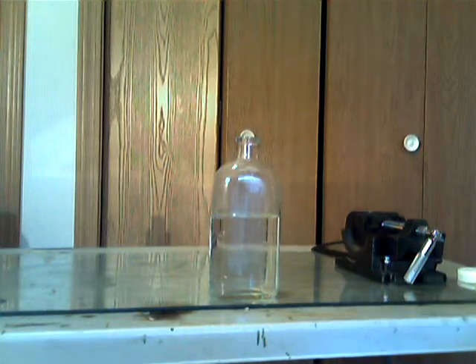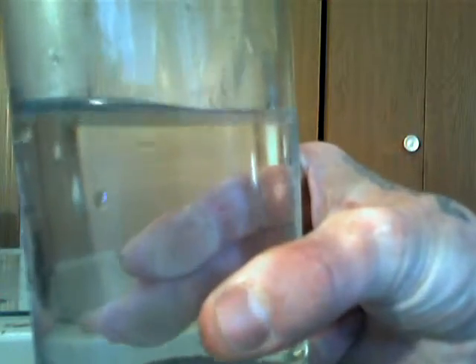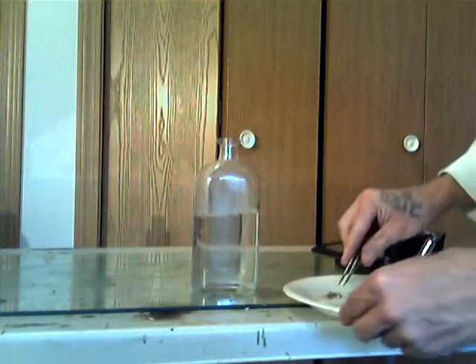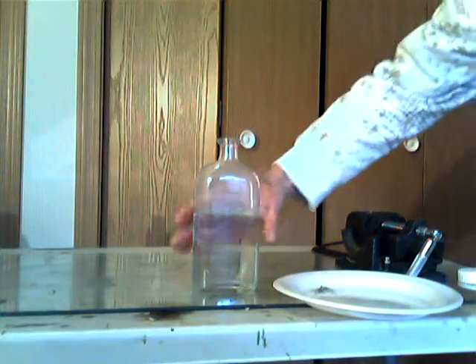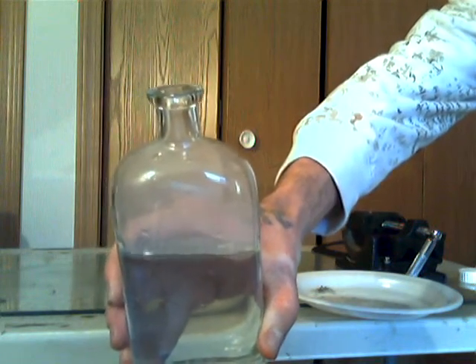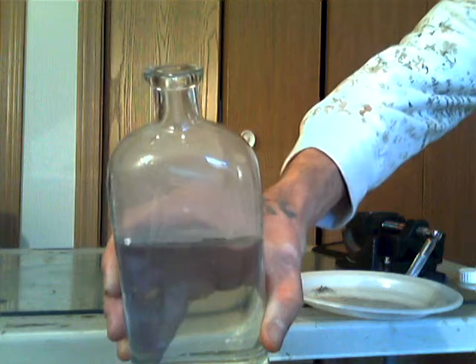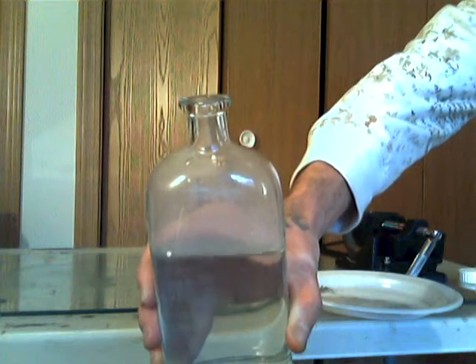I don't know if you can see that — just flying around in there. It's not burning as fast as I thought it would. Maybe it's low-grade sodium.